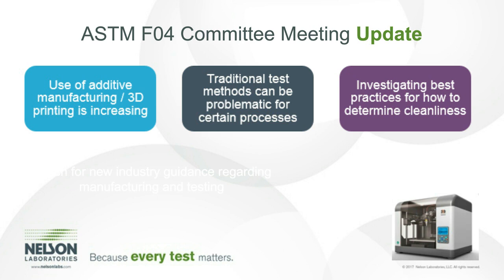What's happening is some of these types of products have a lot of particulate residuals left behind after certain additive manufacturing processes. Those particulates are getting caught in the texture and the geometries of the device. And then you have ultrasonic extraction methods. Ultrasonic, for those unfamiliar, uses sound wave technology to remove these residues from the device. You can think of it as more of a vigorous shaking. Those particulates will come off the surface a little bit and then just float back down after the sonication process is completed.